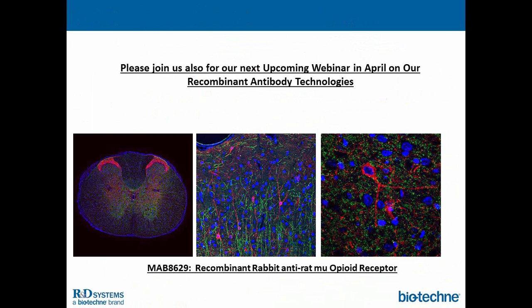Normally you should see the same result. However, with IR dyes, what you're giving up is the enhancement using an HRP system. So you're essentially giving up the enzymatic enhancement, so the sensitivity on IR detection will be lower. That's what I've seen over many targets. So as long as the expression level is still fairly robust, you should be able to reproduce the same results.